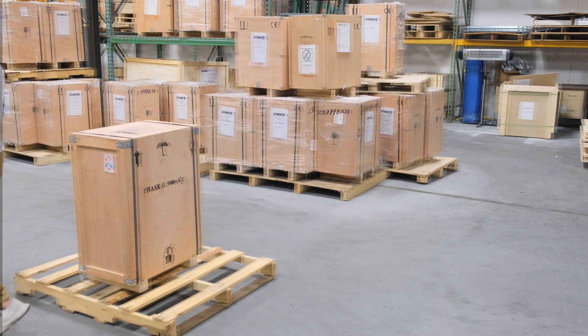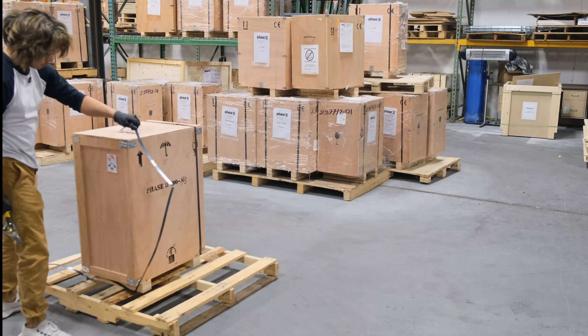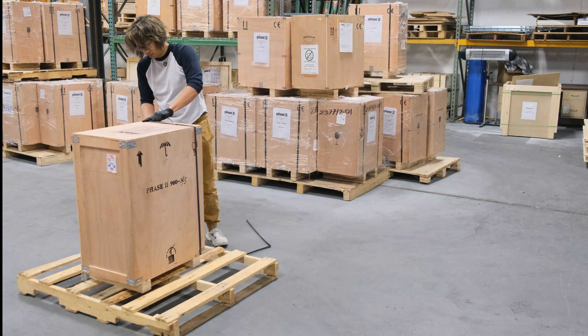Once the crate has been inspected, remove the steel straps securing the crate to the pallet. It is strongly recommended to avoid damaging the packaging material, as it can be used for transport or long-term storage of the machine in the future.